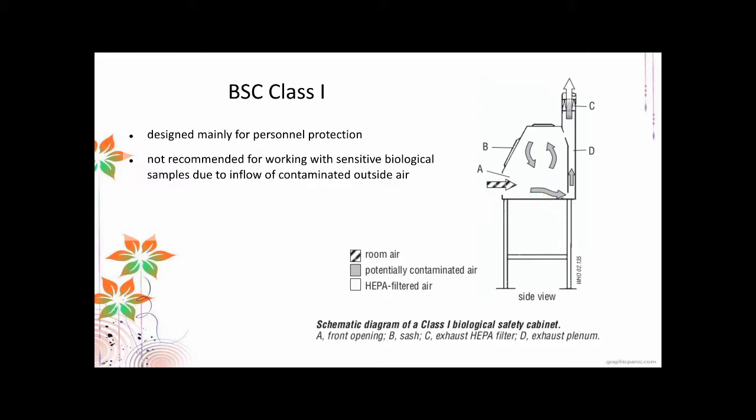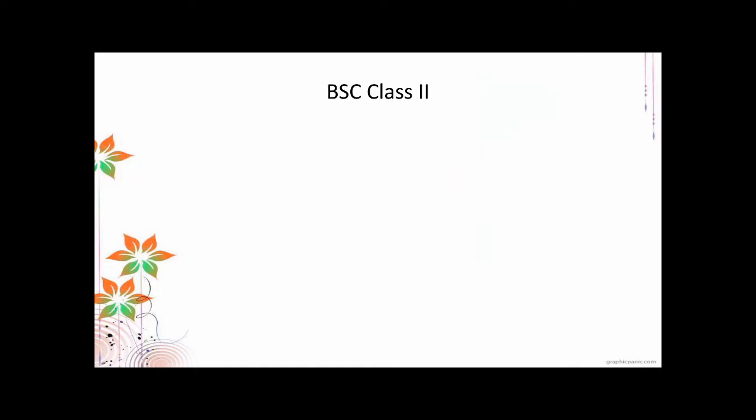And then you have an exhaust HEPA filter and an exhaust plenum to direct the air. So it's not recommended for working with sensitive biological samples, of course, due to the inflow of air. So air comes in through the front opening and exits through the HEPA filter.